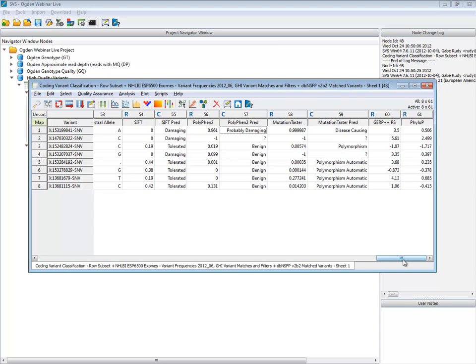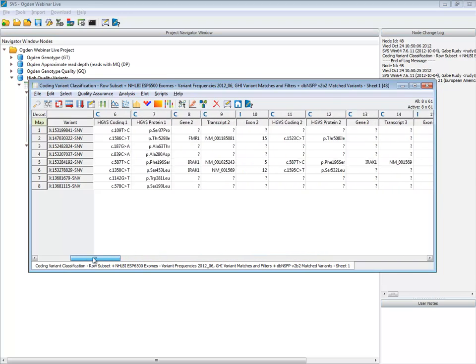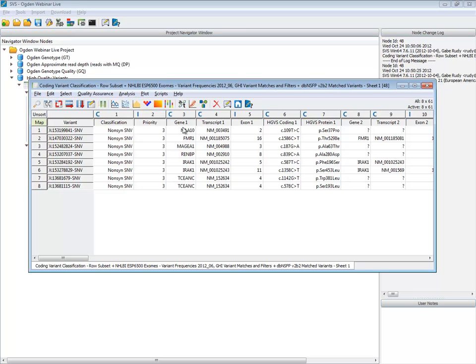So let's go ahead and see, scrolling back over, what this variant is, this novel one at the top of our list. Well, indeed, it's the variant in NAA10, so we have a single unquestionable result here. It is the variant that was shown through functional validation to be the causal variant of this disease. So I'm going to copy this label. It's essentially the chromosome and position of it, and we're actually going to follow this up in Genome Browse.